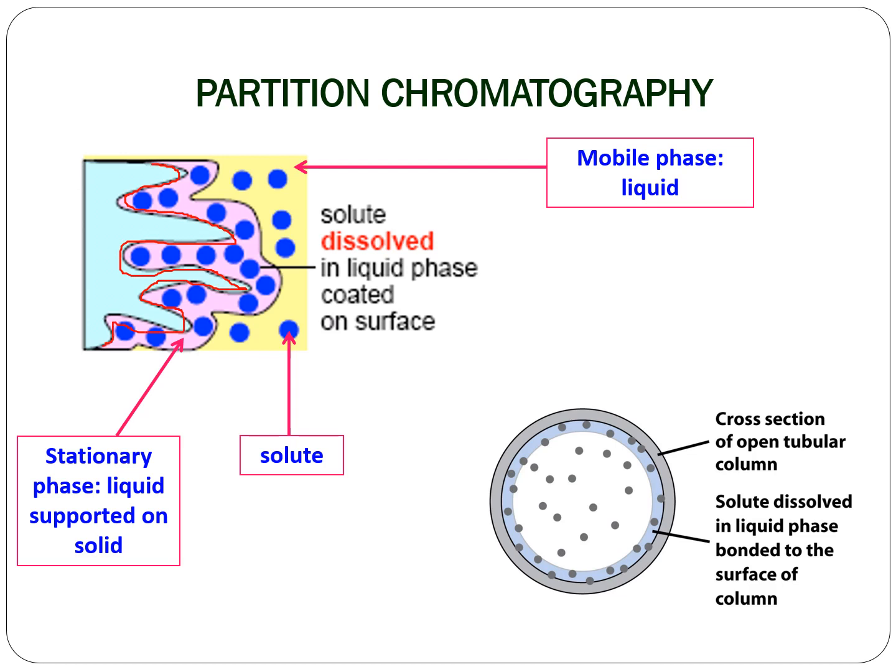Okay, stationary phase kita adalah liquid supported on solid. Okay, yang biru ni solid. Kita punya stationary phase ni adalah yang warna pink ni. Dia adalah liquid supported on solid yang warna biru muda ni.